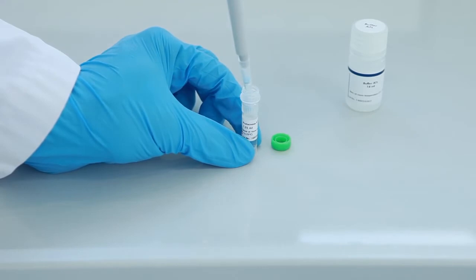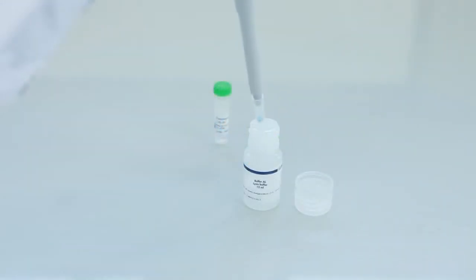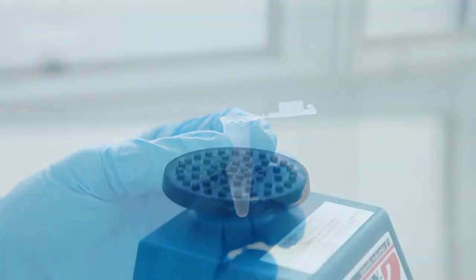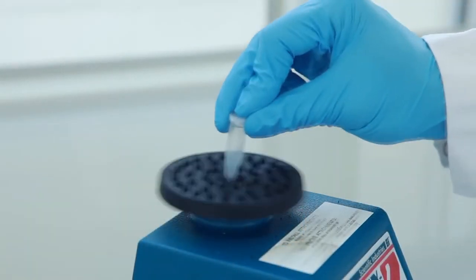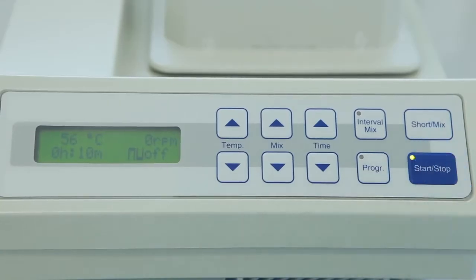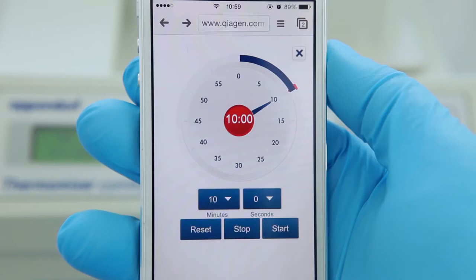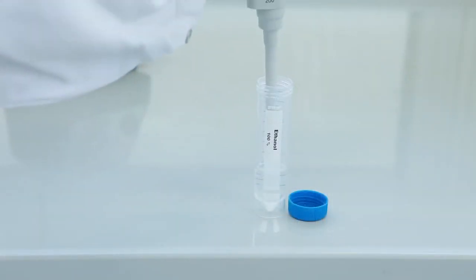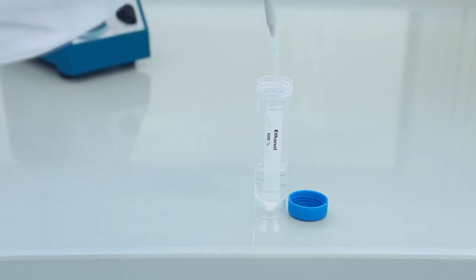The lysis begins by adding proteinase K to the sample. Then add buffer AL for blood samples or buffer ATL for tissue samples, and vortex thoroughly. If you are working with blood, incubate the sample for 10 minutes at 56 degrees Celsius. Add 200 microliters of ethanol and vortex thoroughly.